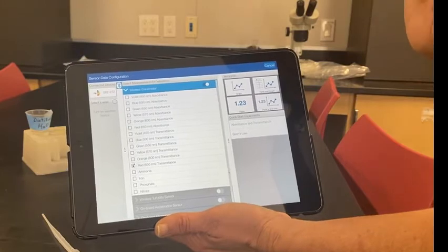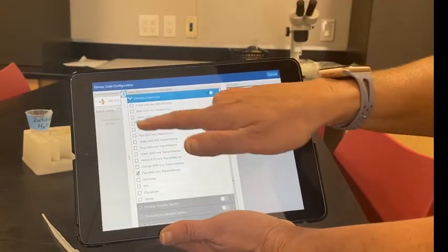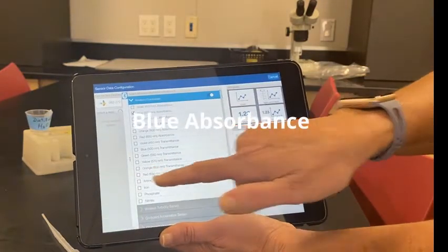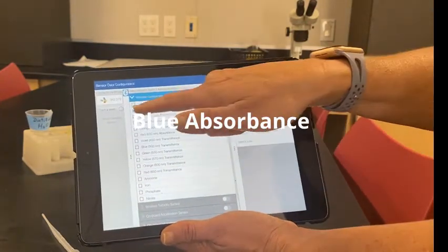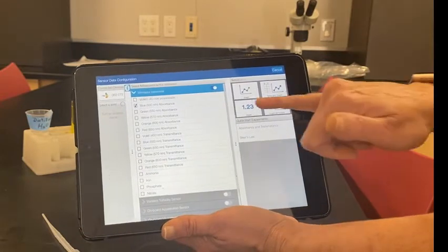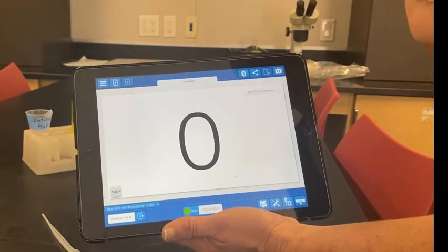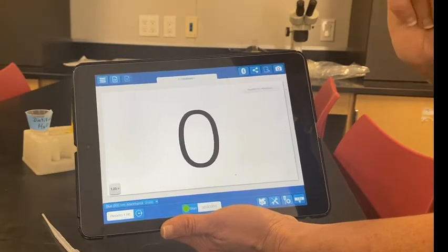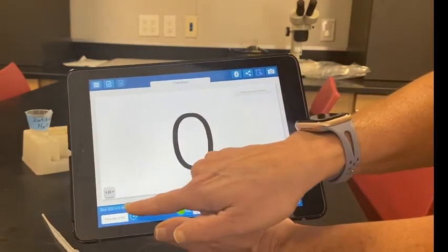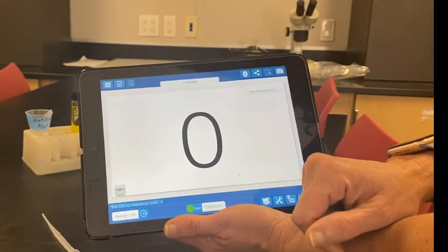Because our bilirubin serum is yellow, you want to do the opposite on the color spectrum. Click out of red and select blue absorbance. Then click on digits. If it doesn't ask you to calibrate, you'll want to go down to where it says blue absorbance — that's a good way to double-check that you selected the right thing — and then click calibrate sensor.